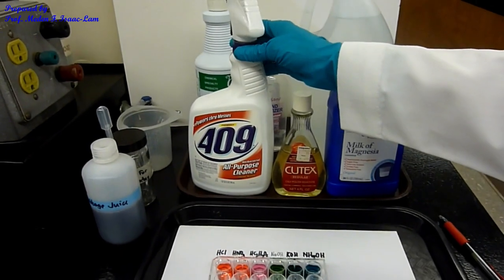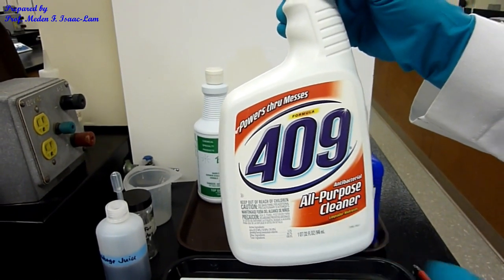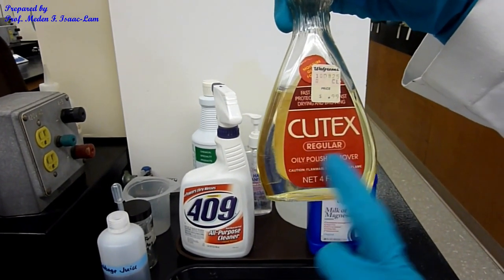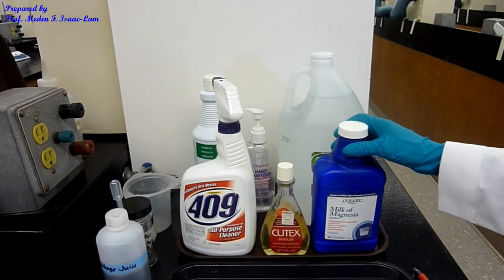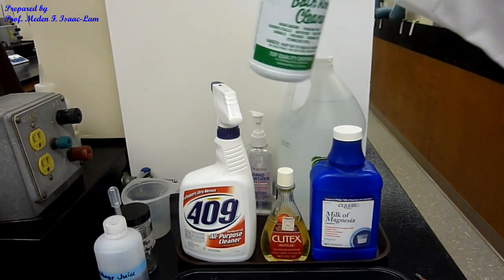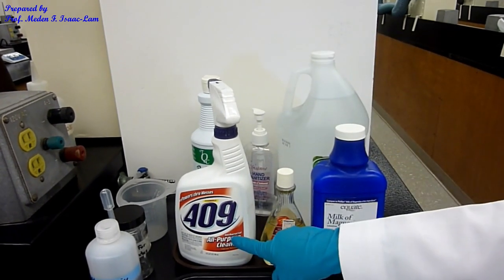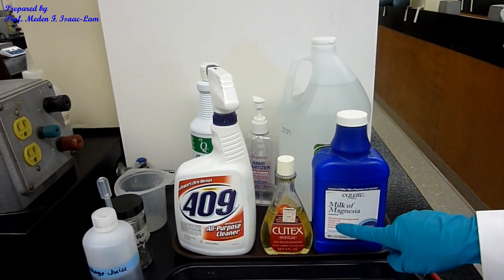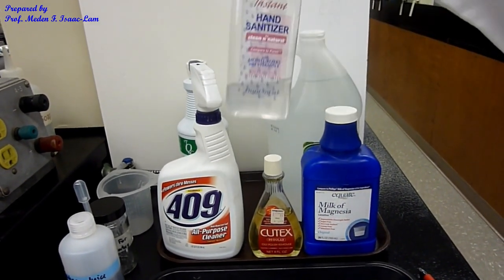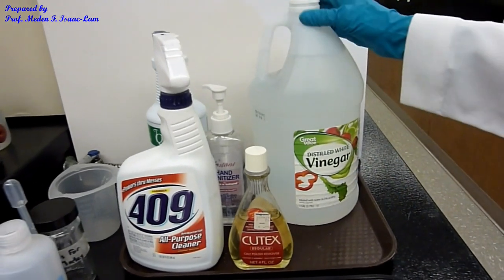So these are the household products. Write this down please: 409, formula 409. It's a cleaner. Then the next one is Cutex nail polish remover. Next one is Milk of Magnesia. Next one is bathroom cleaner. Again, to repeat: 409 all-purpose cleaner, Cutex, Milk of Magnesia, bathroom cleaner, and then hand sanitizer. And then the next one is distilled white vinegar.